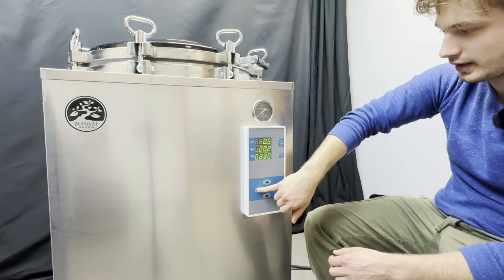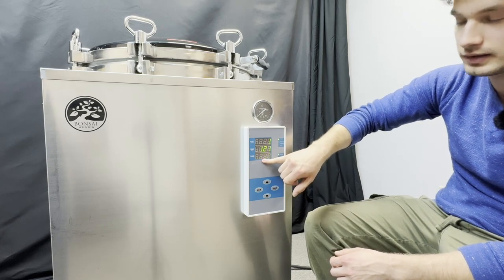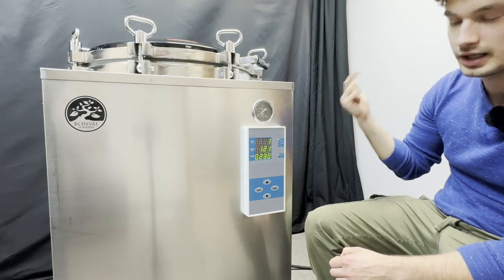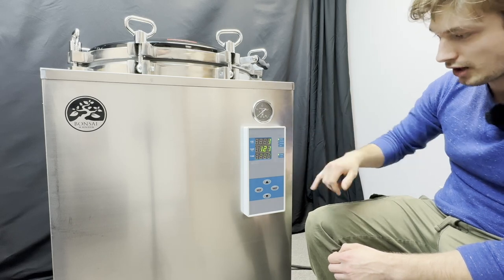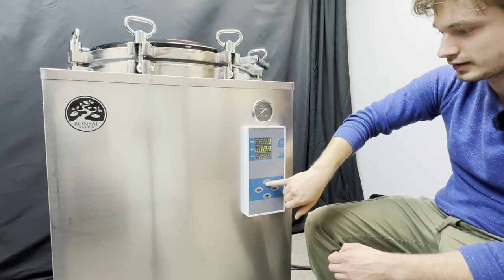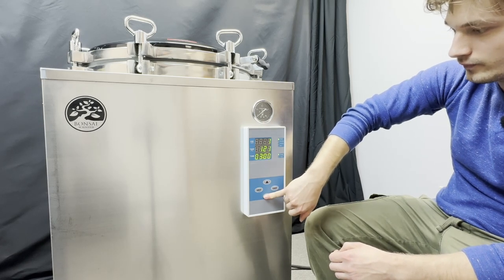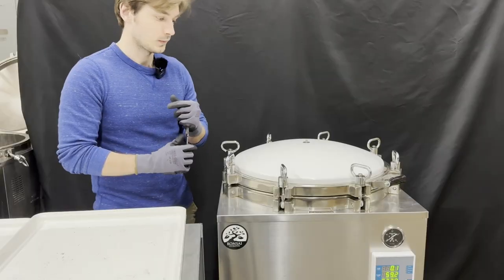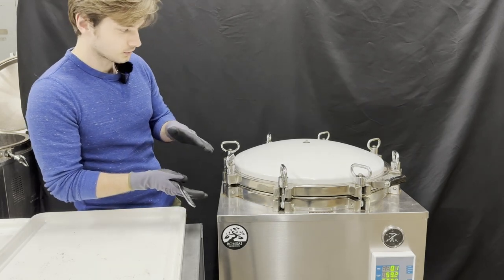After selecting your temperature, hit Enter, then select your time. The time you select is the time your autoclave runs at temperature and pressure — once 121 degrees Celsius is met, this timer will start counting down. We're going to do our cook for three hours. Once you're ready, hit Enter, then hit Enter again.